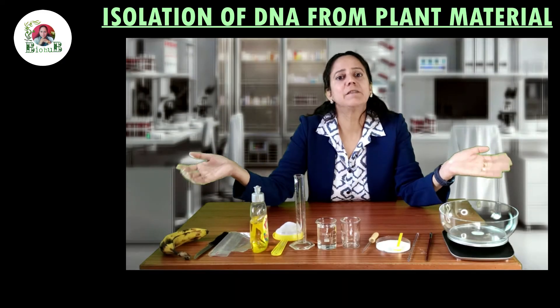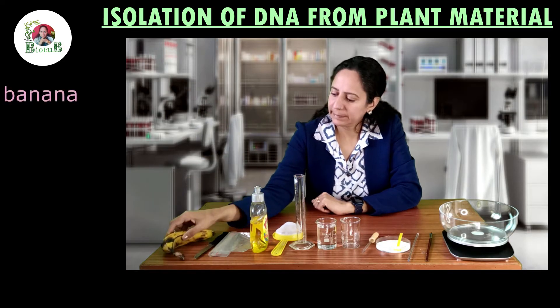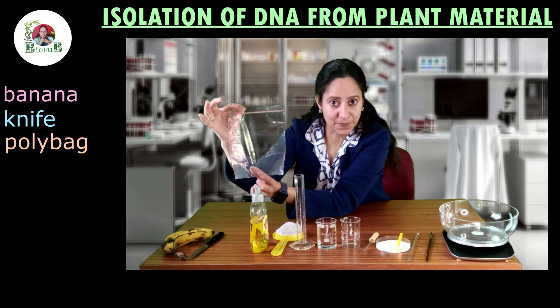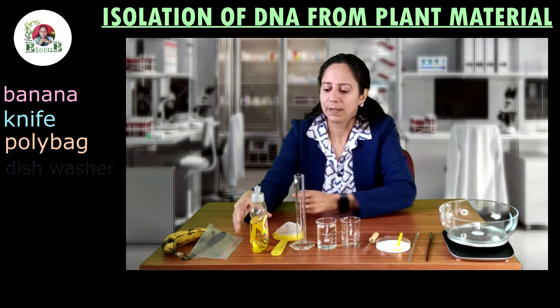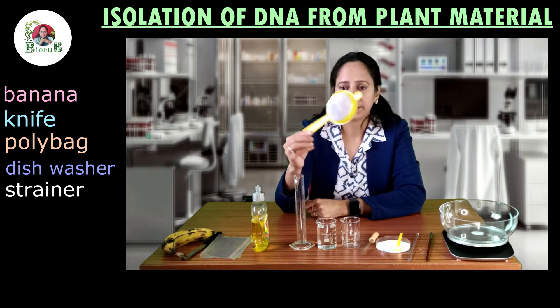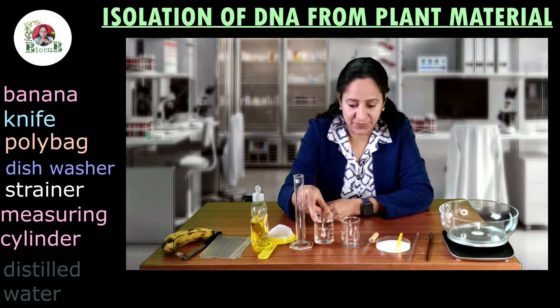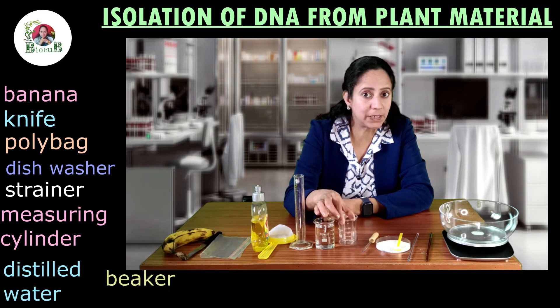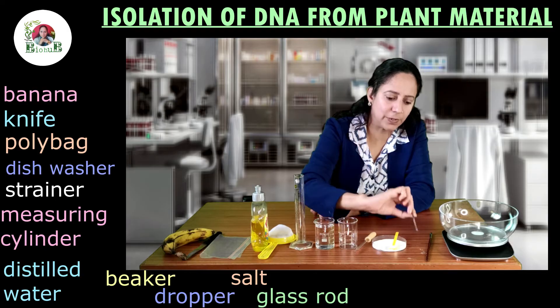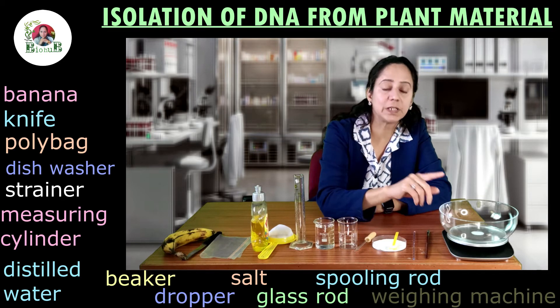These are the materials required for isolation of DNA from plant material: one banana, one knife, one transparent poly bag — preferably a ziplock bag — liquid dishwasher, one strainer, measuring cylinder, 100 ml of distilled water, one empty beaker, one dropper, common salt, one glass rod, and one rod for spooling the DNA.